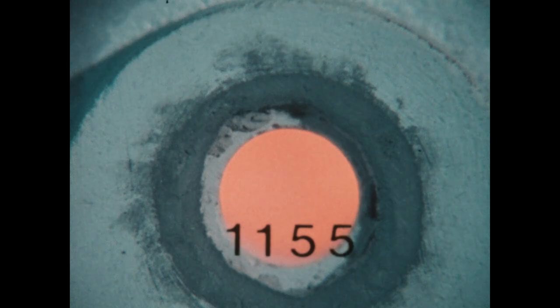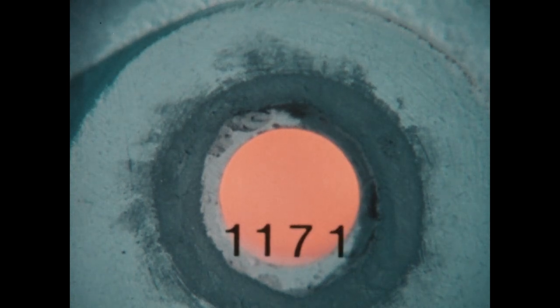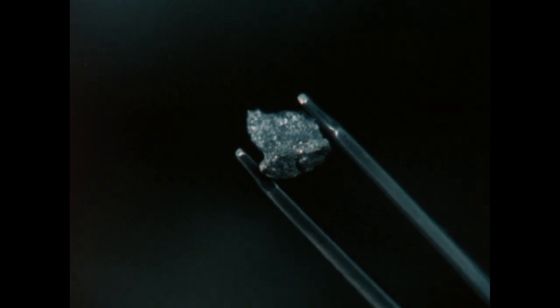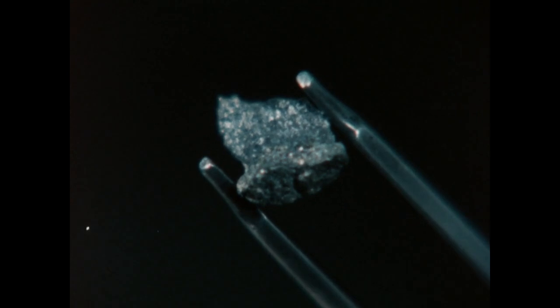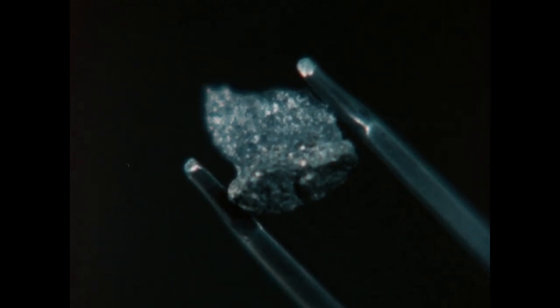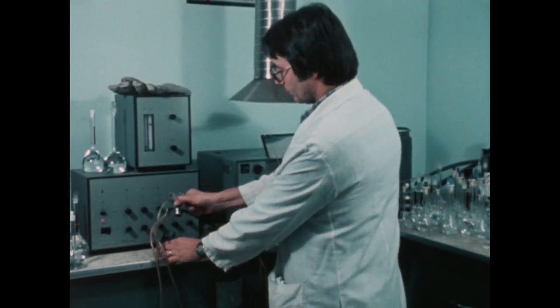The last golden flecks melt at around 1171 degrees Celsius. But gold melts at 1064 degrees. So the shiny flecks aren't gold. But we still don't know what they are. We can use a spectrograph to photograph the material's atomic spectrum.